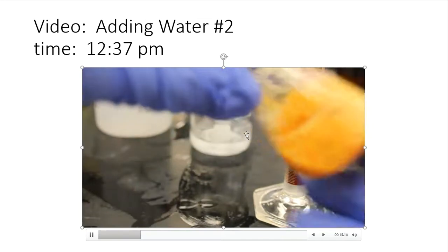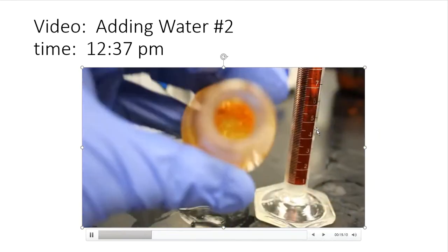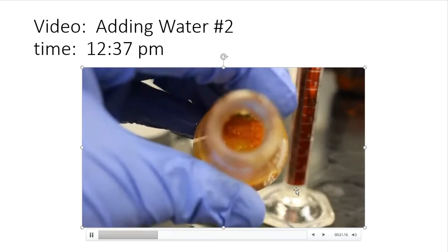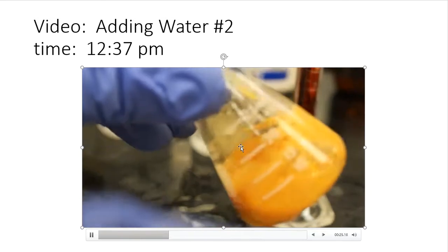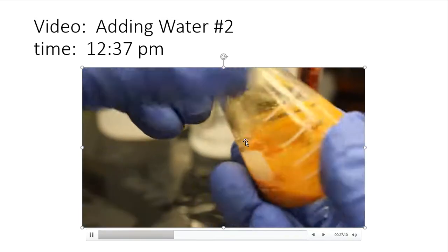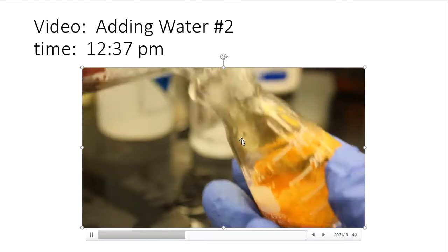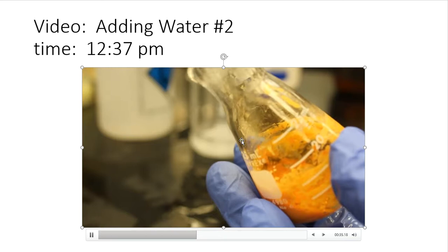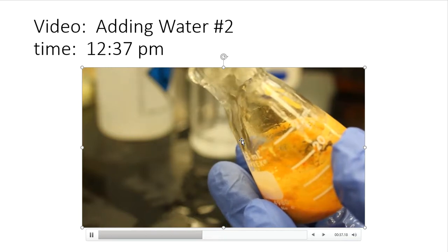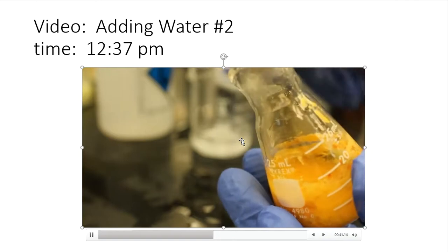So there is the final look at what this stuff looks like before I add the water. A lot of sludge, a lot of crystal there at the very bottom. Completely different color than the first one. And here goes the water. And what did I tell you?